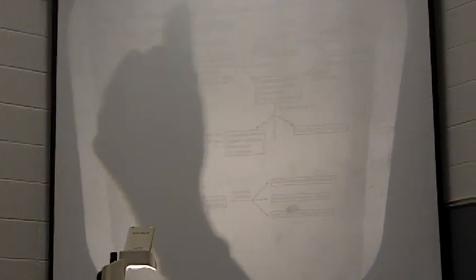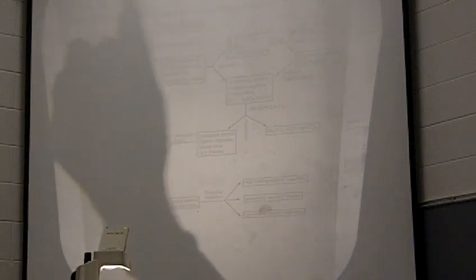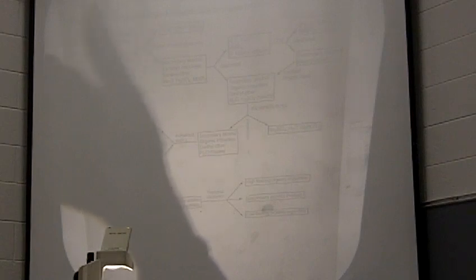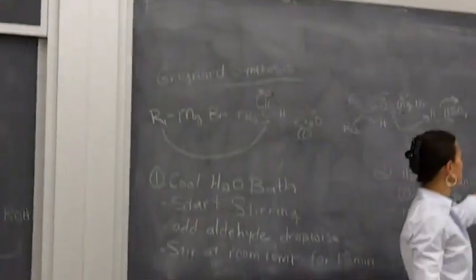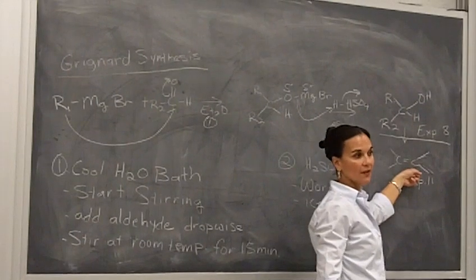So we're here, we've got all of our stuff in there, okay? We've got our aldehyde, our Grignard reagent. Hopefully we've made our alcohol, or at least the intermediate on the way to our alcohol. And we're now going to go on with the workup. So we're adding this sulfuric acid solution. We've got to be really careful, because if we get things too hot, it's really easy to go to the alkene, all right? So you have to keep that addition of the sulfuric acid under control.